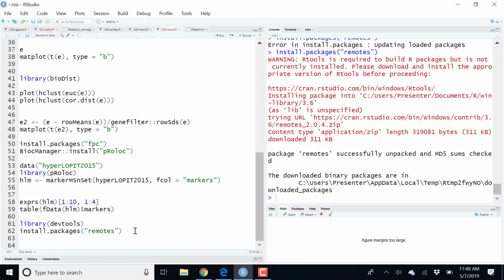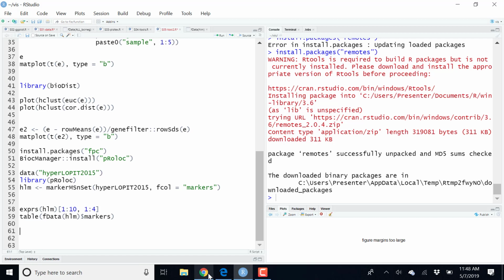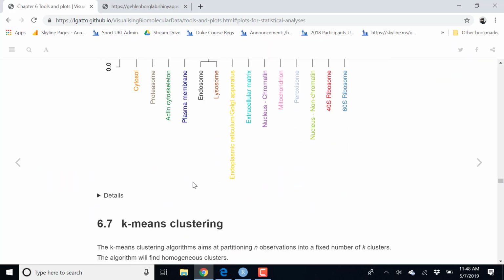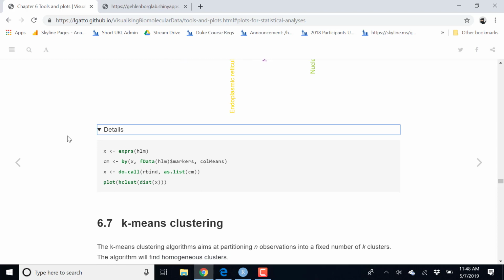Okay, let's proceed. I don't think we're going to try to install these packages, these dependencies one by one. Sorry about that. I'm going to show you my suggestions for this exercise, and then we'll move on and use another one for the next part.